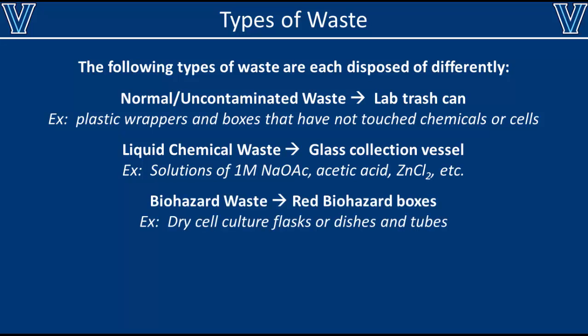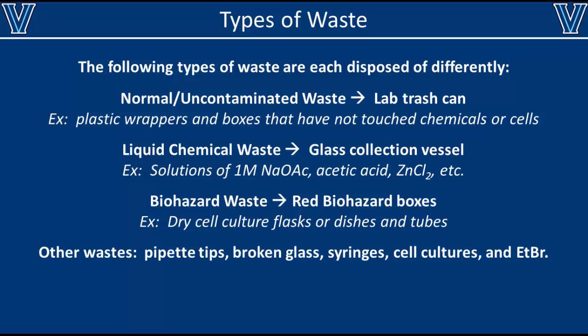As another example, if you generate any waste that's come into contact with cells, proteins, or DNA, that'll have to be collected in one of our red biohazard boxes. In addition to these examples, there are several other types of waste that you'll generate, each of which we'll go over in this video.